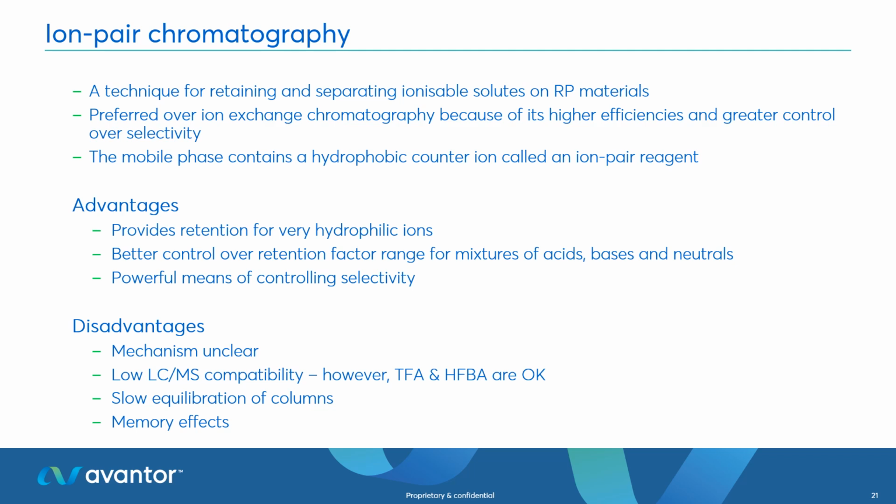However, the mechanism is still a little unclear. The compatibility with LC mass spec, which is the traditional approach for the analysis of biologically derived samples, is not so good. It's not compatible. However, ion pairing reagents such as TFA, HFBA may provide a route forward there. Typically, it's slow equilibration of the columns, and classically there are substantial memory effects with this approach as well.